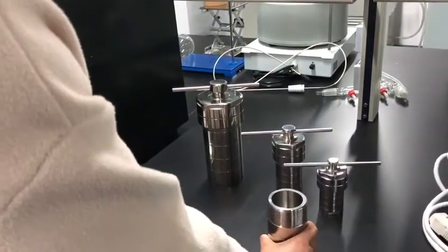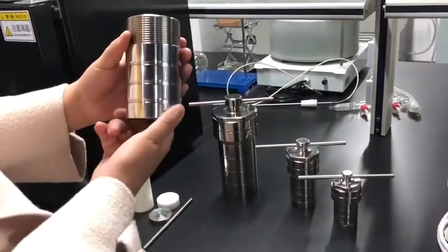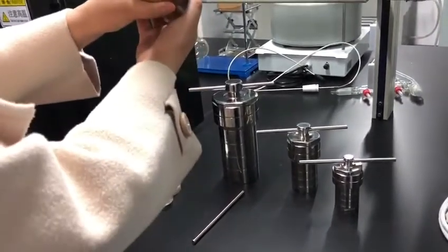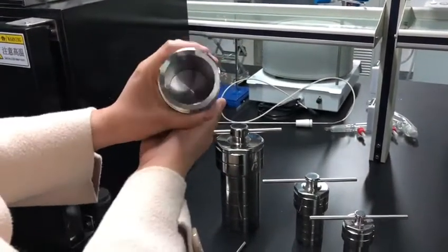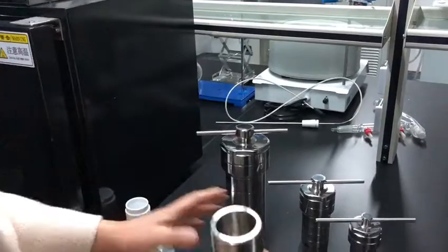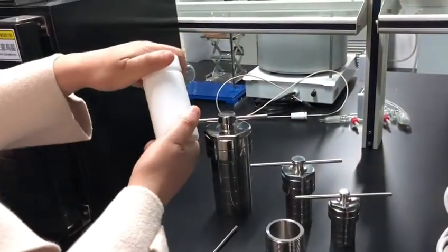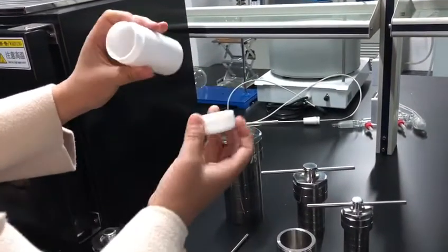These are the parts of the reactor. The outside vessel is stainless steel — this one can take off. The white part is Teflon: a Teflon vessel, Teflon liner, inside liner.